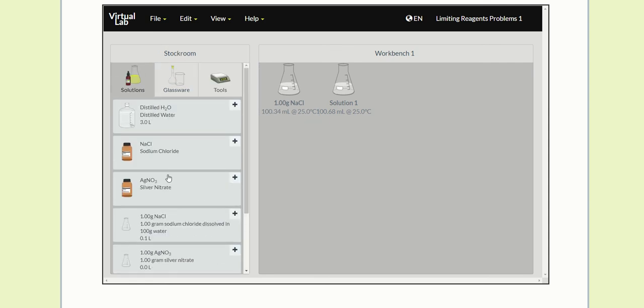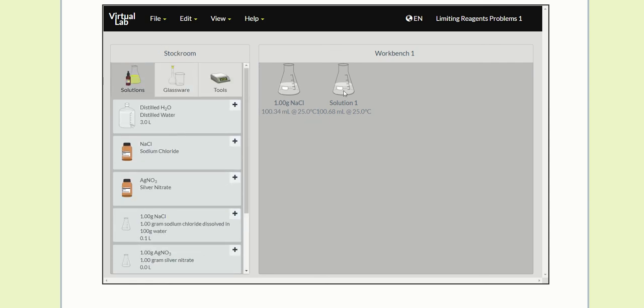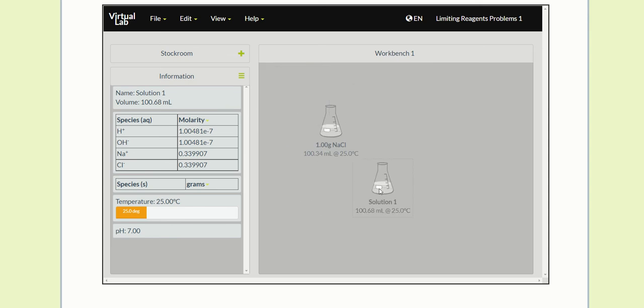The other important piece of information is knowing how to mix solutions. So here I'm just doing something random. This isn't what you're doing in the lab. I just want to show you how you are able to mix or add either a powder, so a solid, or a solution to another solution, basically from one glassware container to another. That's what I'm showing you. That's what I'm reminding you about.